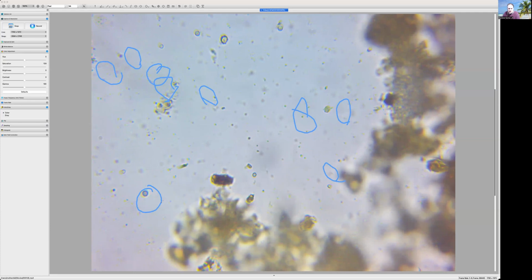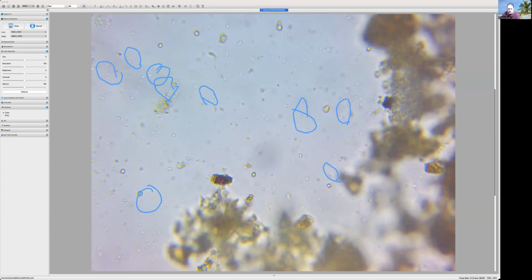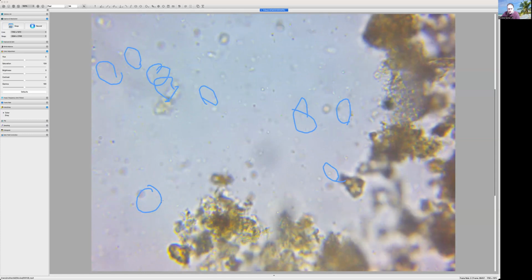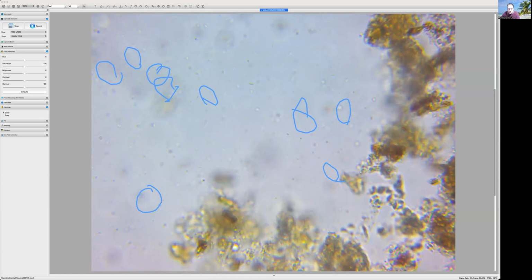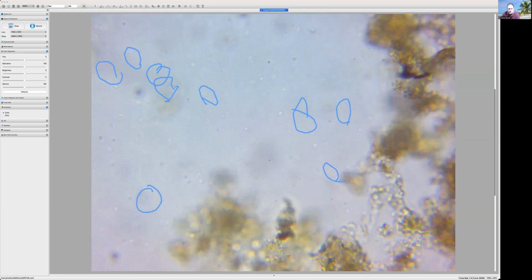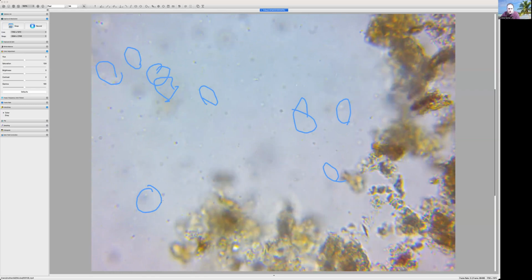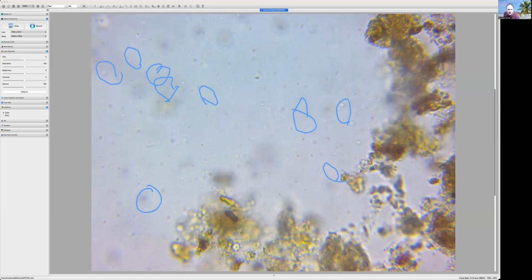Okay, I wanted to get to that aggregate. I want to stay off the side of it so I can focus in and out without that camera. Okay, so we just saw a flagellate. They're just taking off and moving everywhere. But it's really exponentially grown in numbers. This guy going up here.